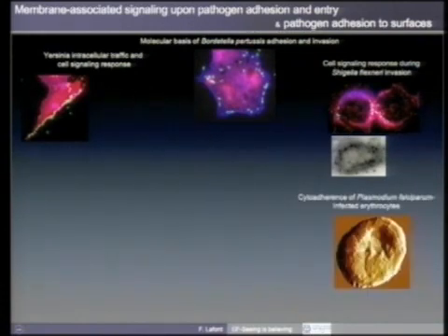So we are using near-field microscopy, and for instance, we are studying adhesion of erythrocytes that are infected with Plasmodium, or also the interaction of Listeria with the host membrane, or Listeria biofilms to cell surfaces, or also spores with materials.